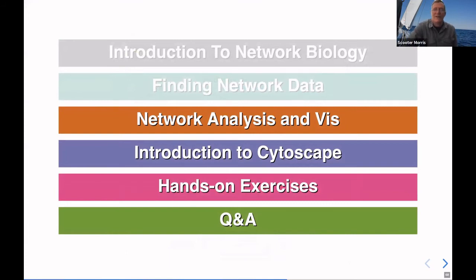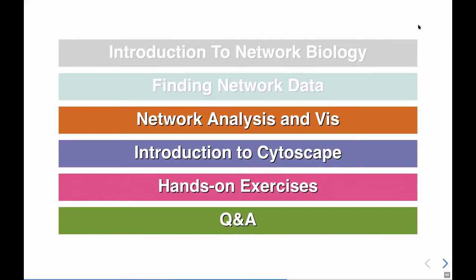Any questions about that overview before we dive a little bit into analysis and a lot into visualization? We okay? Scooter, I have a question about the background. How can I set the background in the String app?